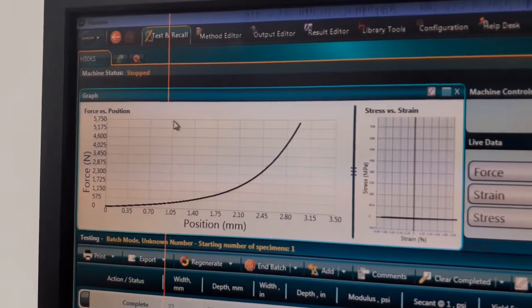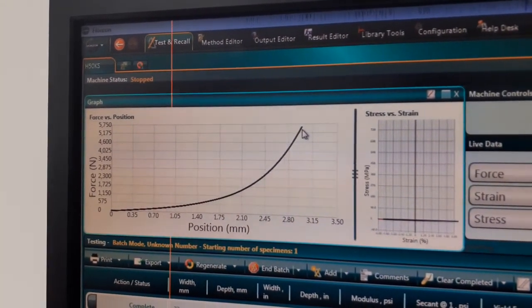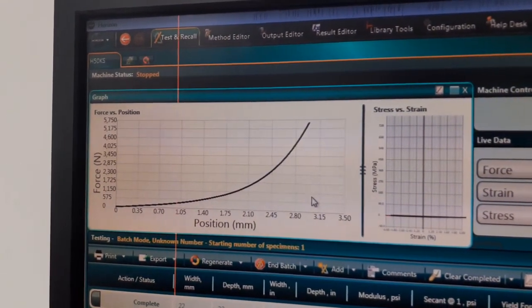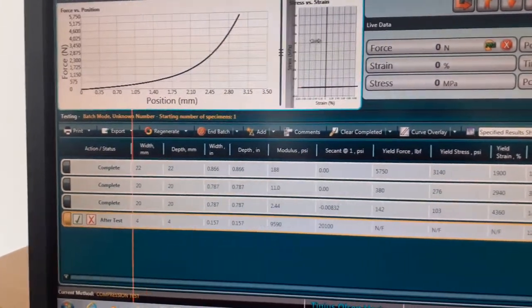The maximum force is 5750 and our sample is approximately compressed 3 mm, you can see here.